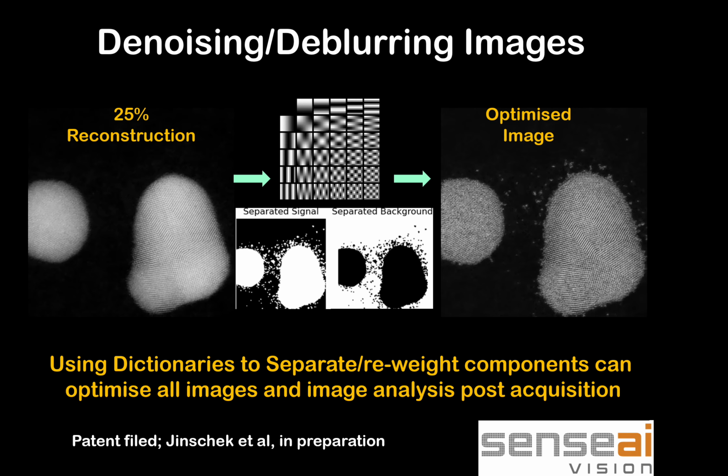Now, in those images that I've just showed, our goal there was to get the images to reconstruct as quickly as possible. And those images there were coming in about 10 frames per second. It was slowed down in the way it was being presented because the computer was running the reconstruction and the whole thing together, but effectively it was being acquired at 10 frames per second.